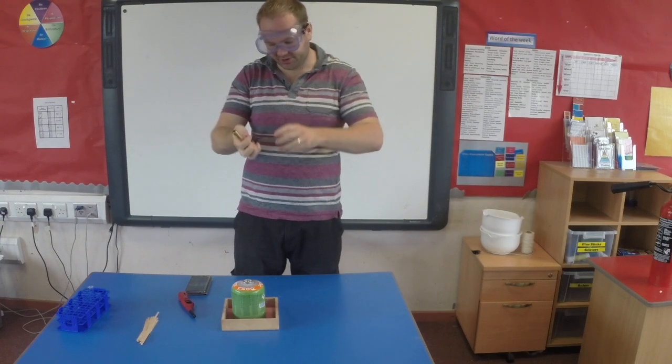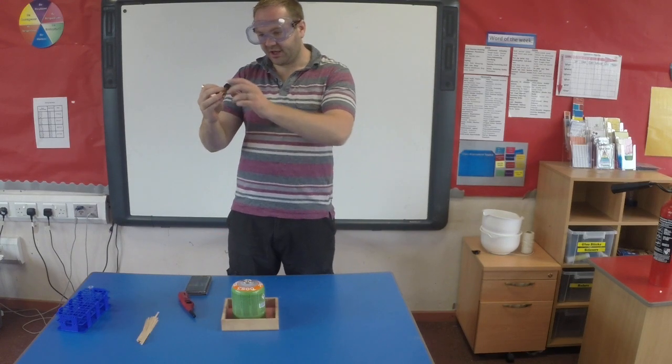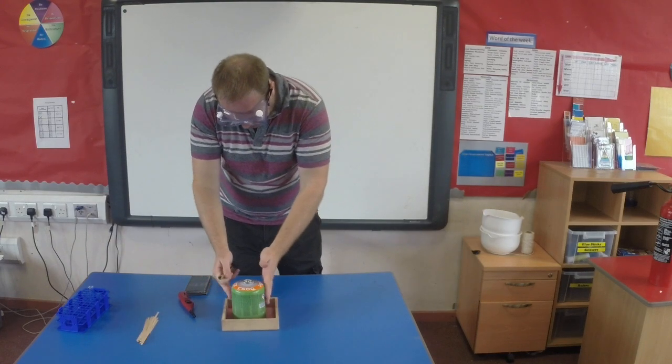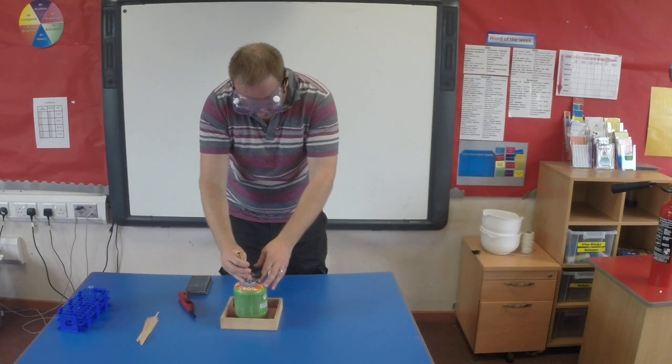There we go, fashionable. And now to connect the burner onto the cartridge, first of all I'm going to make sure that the gas supply is off. So if I turn it that way, that's on. I'm going to make sure it is turned all the way towards the minus so that as soon as I connect it up it's not going to be leaking any gas. So that's off.